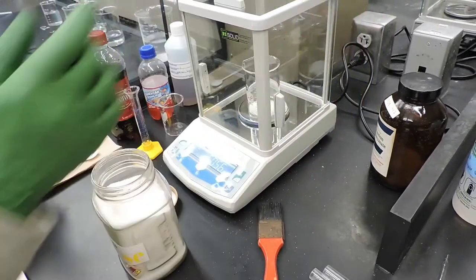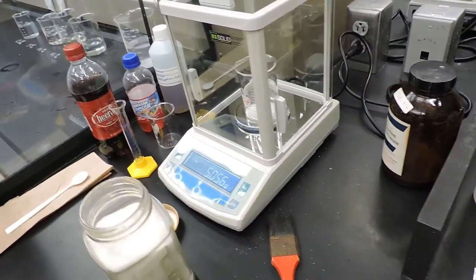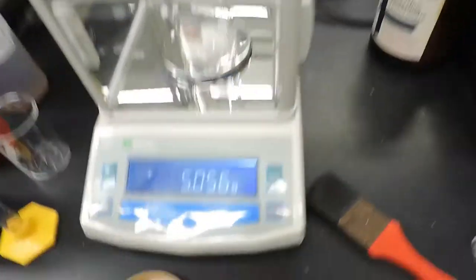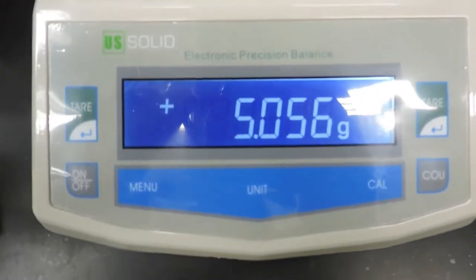And the exact mass of our 5 grams approximate of sugar will be 5.056 grams of sugar.